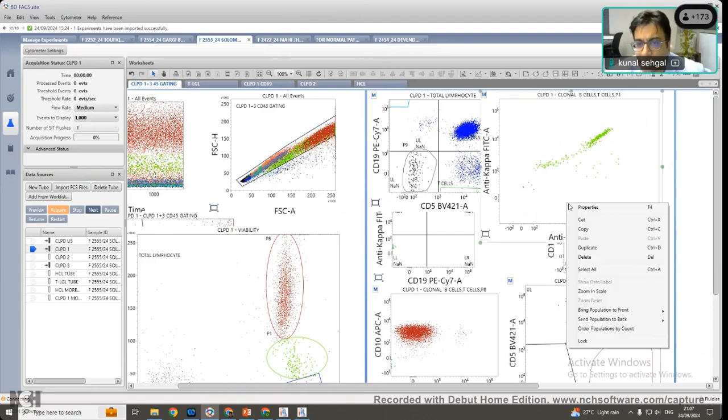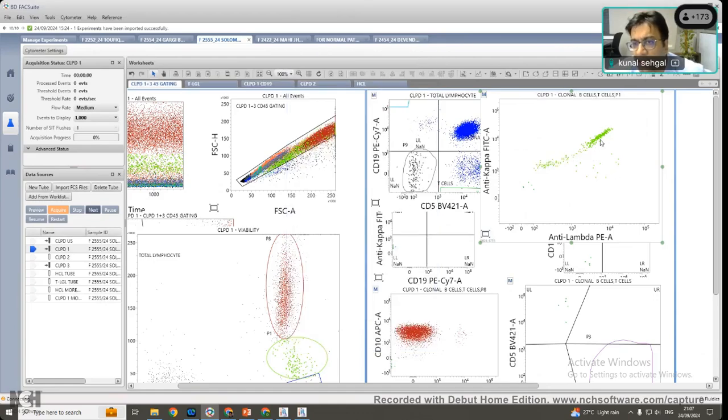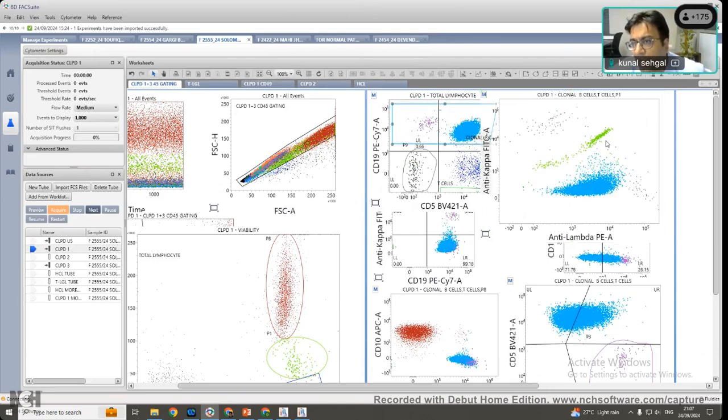Similarly, activated neutrophils can sometimes also express kappa and lambda. Or in this case, this is autofluorescence in FITC, so we'll not get there and complicate matters, but this is how it comes. But normal cells, if they work, then that is great. And with the help of normals, with the help of monocytes, you know that this is lambda positive, this is in the center, this is polyclonal. I hope that answers the question.